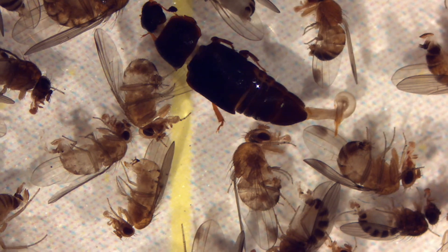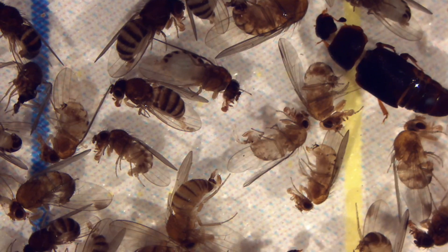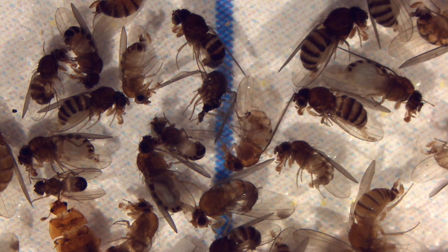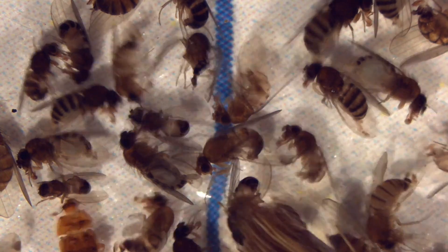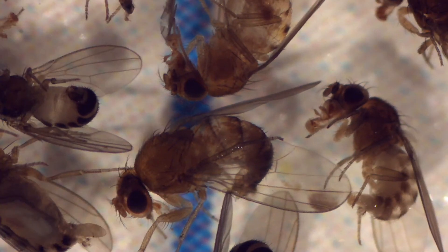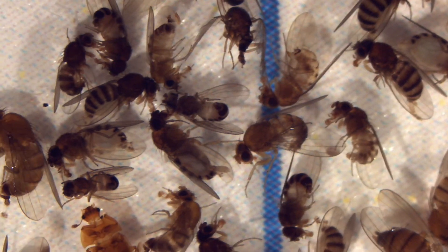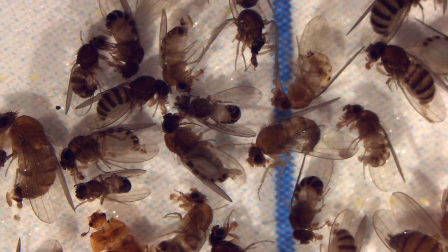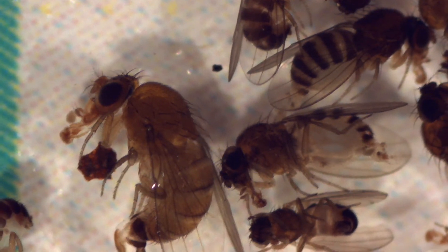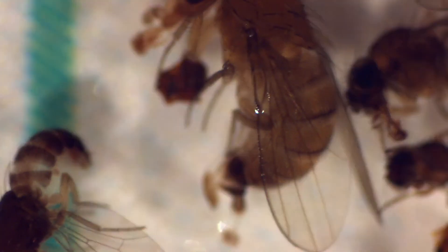Keep looking. Up at the top is a female, down at the bottom is a female. And it looks like there's another male right there in the bottom center. We'll zoom in — look at that front leg, you'll see those two spurs, those two combs of hairs. Here we see another female on the left. Note the ovipositor has the teeth.